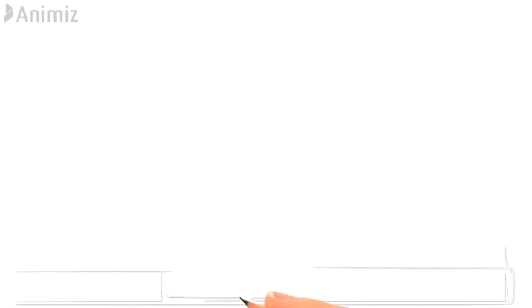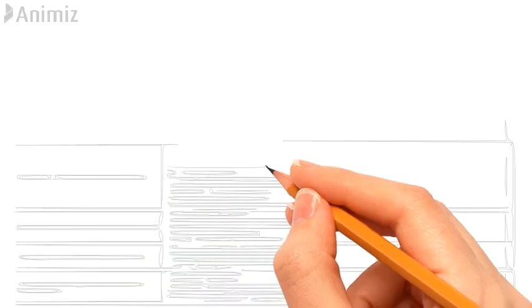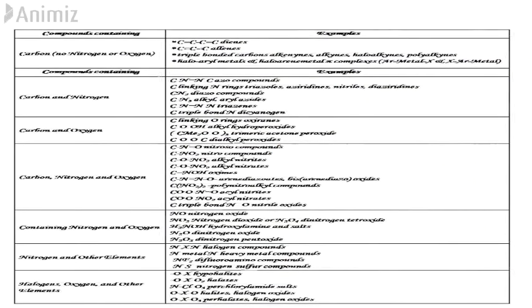Energetic substance in general can be identified by the presence of hazardous molecule structure such as a peroxide group, nitro group, azo group, double and triple bond, ring deformation or steric hindrance, all of which influence the stability of the molecule. The table lists the number of groups that have relatively weak bonds and that release substantial energy upon cleavage. The list is not exhaustive. The listing does, however, provide assistance in screening the chemical structure for determining which should be investigated further before considering handling even in small quantities.